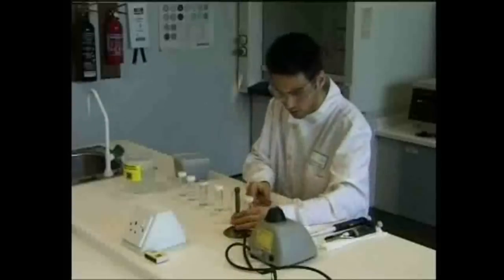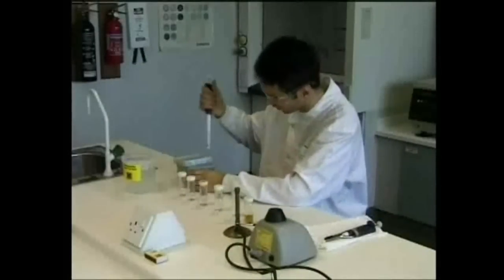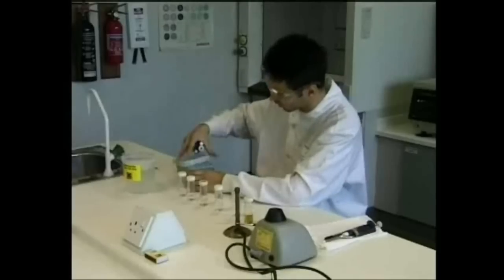When you're working with microorganisms, there are several guidelines to follow to make your work safe. Your laboratory will have its own rules for conduct and safety.